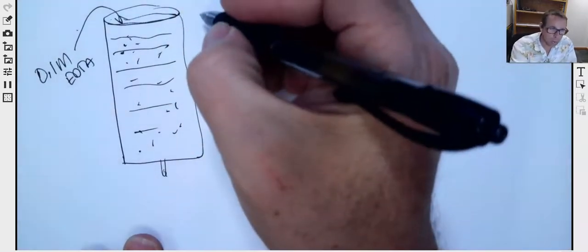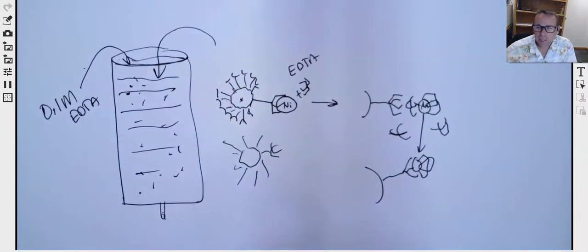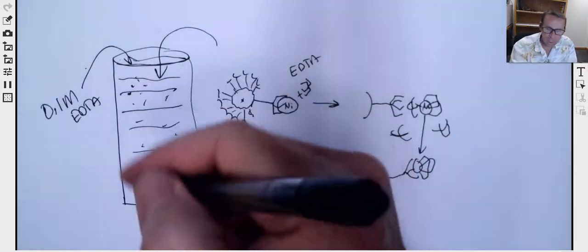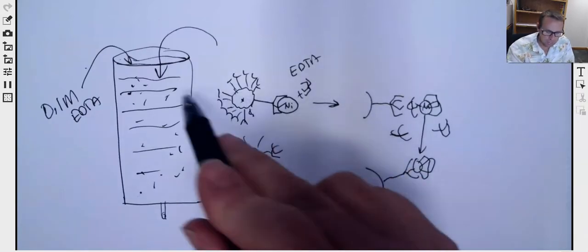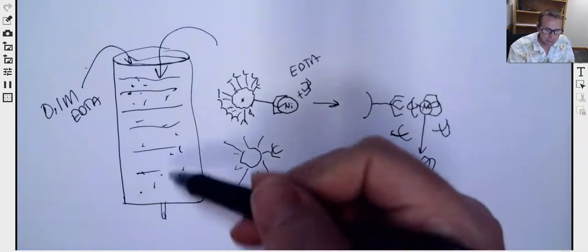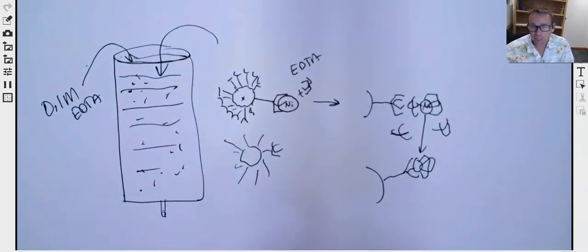So when we poured our water sample then over our EDTA resin segment, the EDTA would pull out any heavy metal ions and bind them. Okay? So hopefully that video kind of clarifies the relationship between the nickel, which initially starts on the resin, us adding EDTA to pull it off, and then leaving it primed and ready to take metal ions from your solution that you want to clean up.